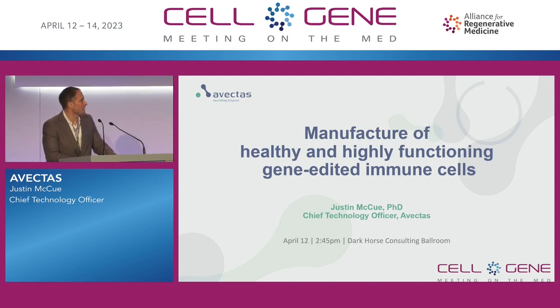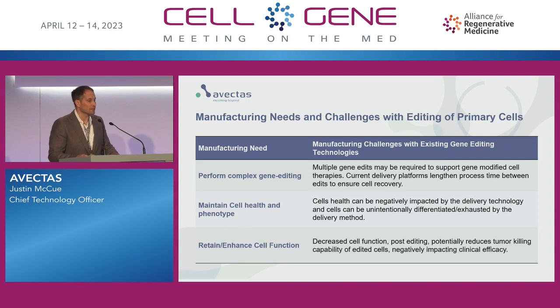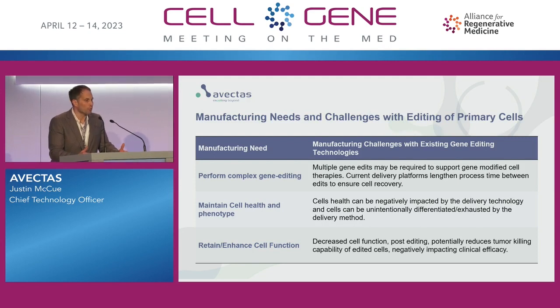So I'm going to talk to you today about the manufacture of healthy and highly functioning gene-edited immune cells from Avectas. What we've heard throughout this morning and this afternoon is that there are multiple challenges with the editing of primary immune cells. For example, in the previous presentation we saw the need to multiplex edits. When you perform those multiple edits, that can require additional manufacturing time to allow the cells to recover before you do the next edit. So one of the challenges is to decrease the manufacturing time and come up with a more efficient process.